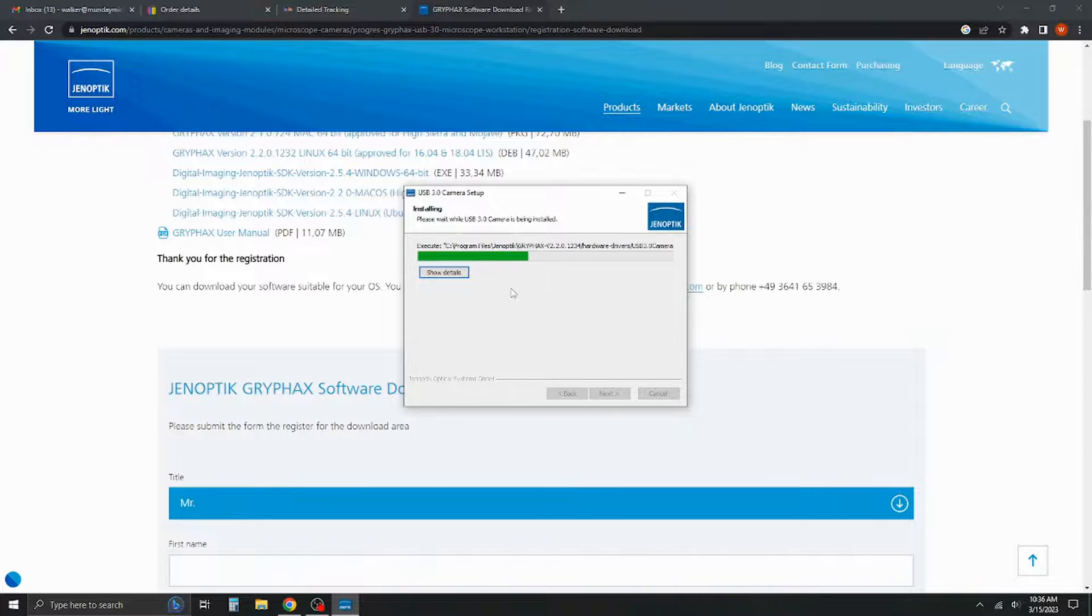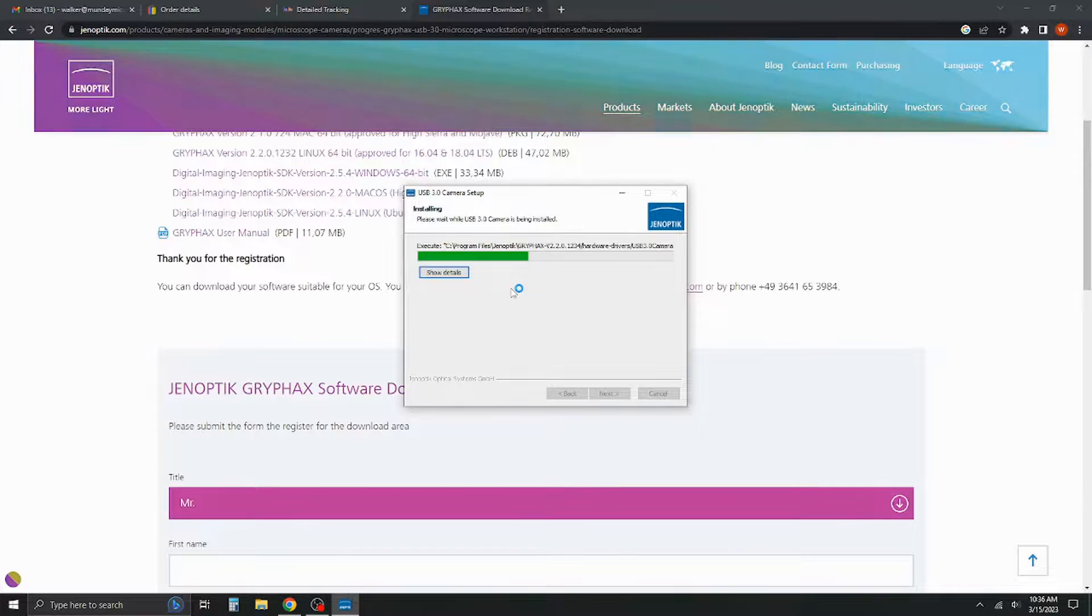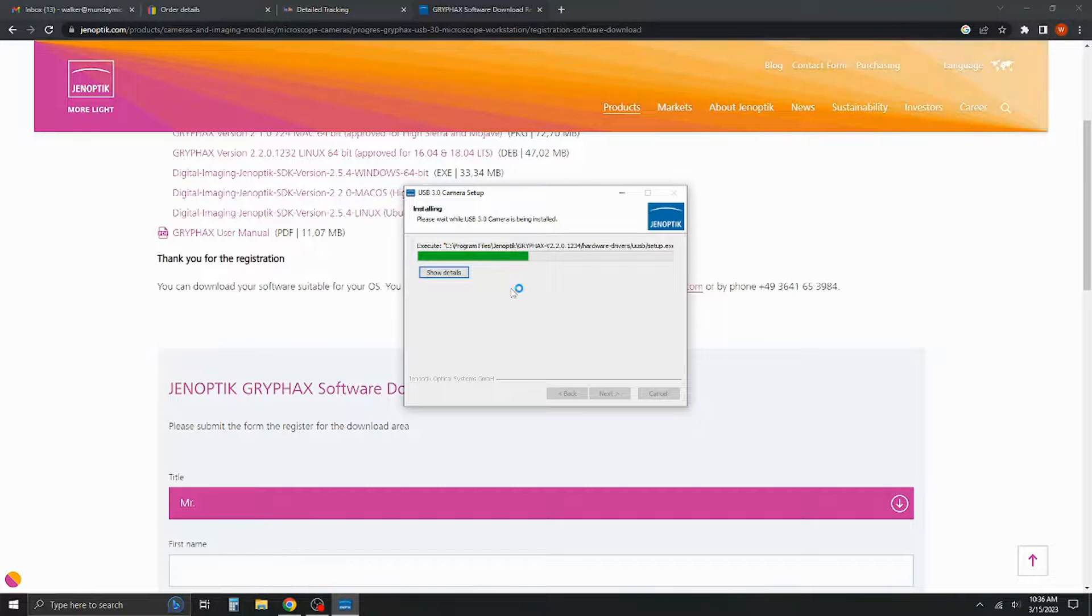It should only take a second or two. It's usually pretty quick, although your mileage may vary depending on the speed of your computer.